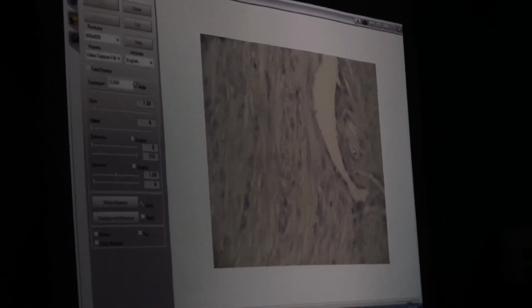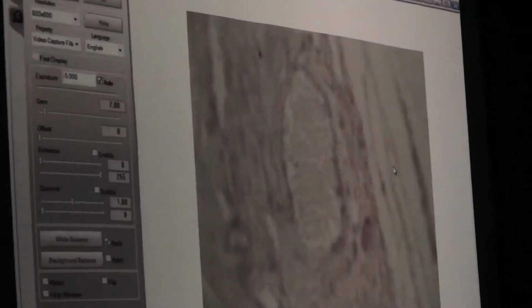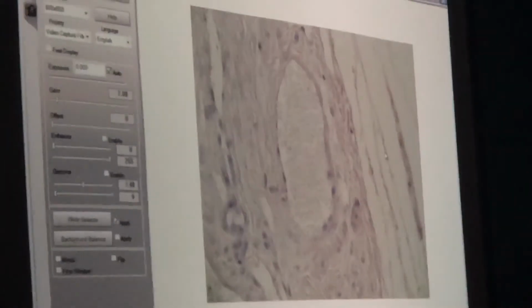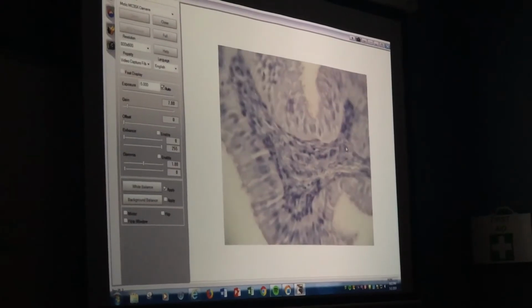As I get out into the wall of the fallopian tube, what's all this stuff going to be? Smooth muscle. And then at the end, I'll see adventitia. Okay, what's that thing in the middle right there? Yeah, probably a vein. Okay. Anything else we need to see on here?